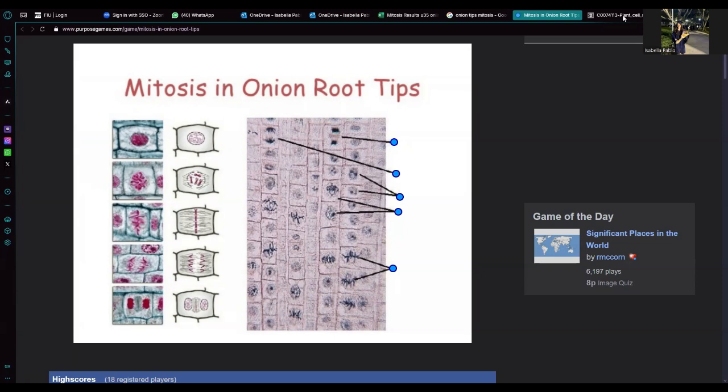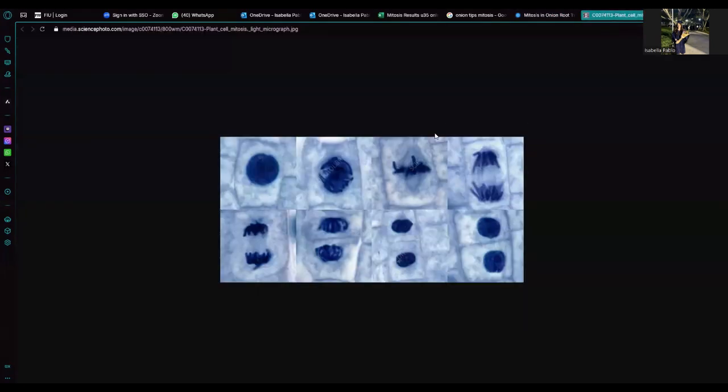And that's just because, again, gibberellic acid ups the rate of mitosis. Okay. So this is another picture. This is more closely related to what they actually look like in lab since we dyed them using a blue dye. Anything after this first picture is in mitosis. Okay. So when we're looking for interphase, my students were looking for this dark ball that wasn't really able to differentiate any specific chromosome. This is an interphase.